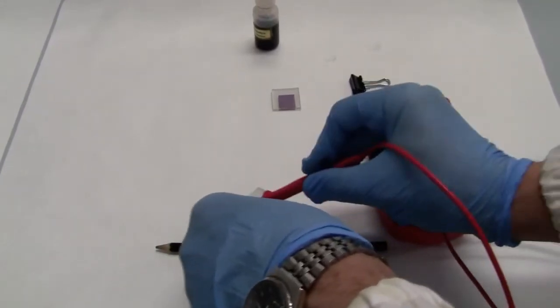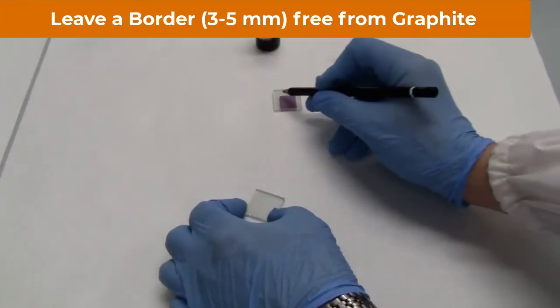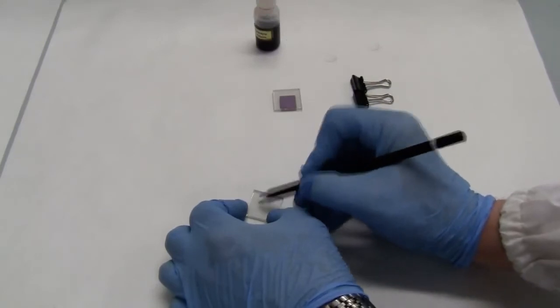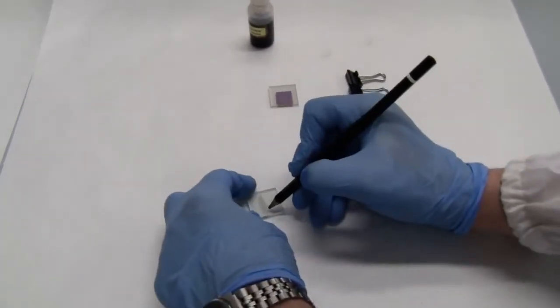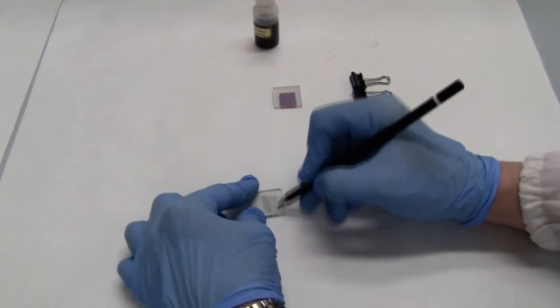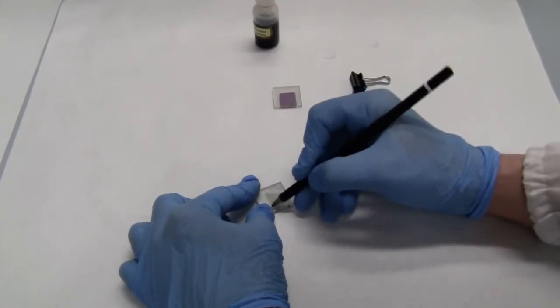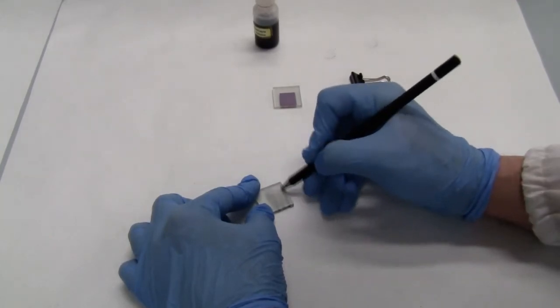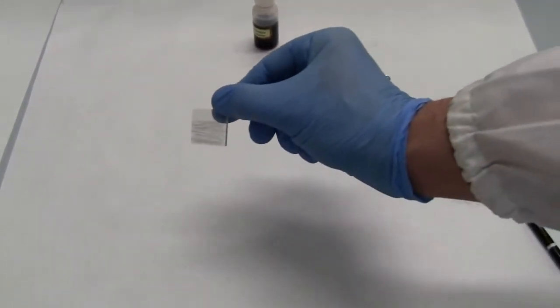Once we have determined the correct side, we can use our pencil to cover it with a layer of graphite, but we have to save a linear space like the one we have just shown on the dyed glass. Once it is quite colored, but not extensively, it's not needed to make it become completely black. We cover all the side of this glass, apart from the line we left uncovered, and we can continue with the procedure. Now we can see how this glass appears.